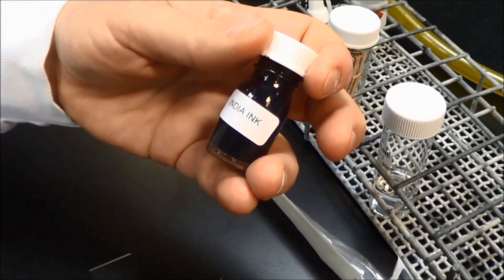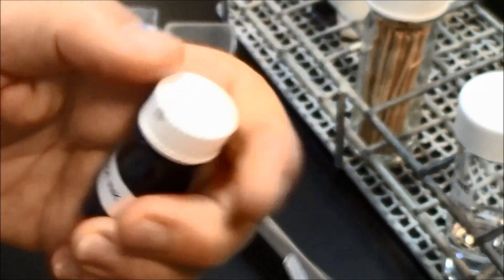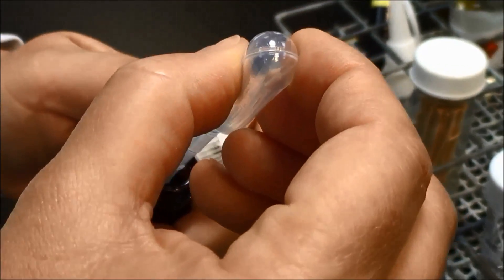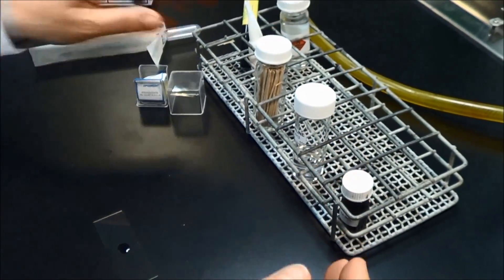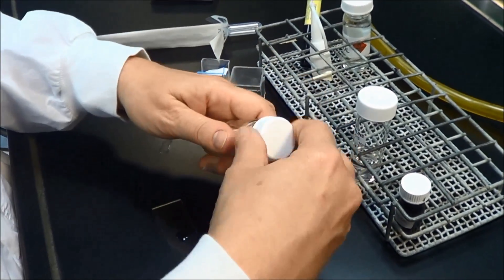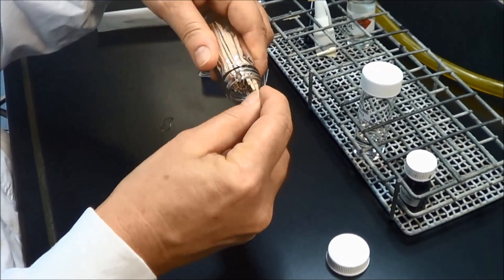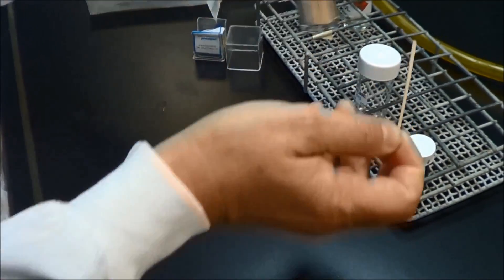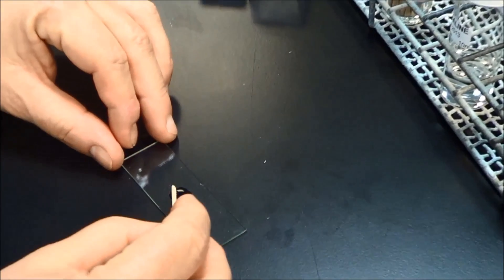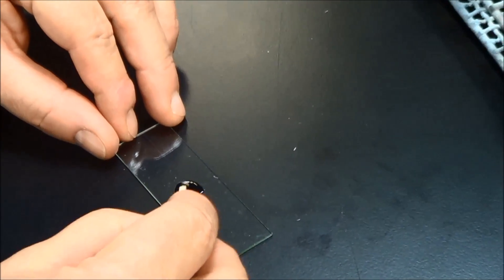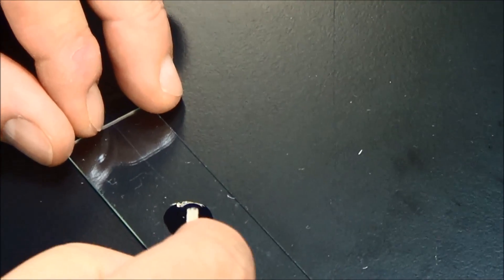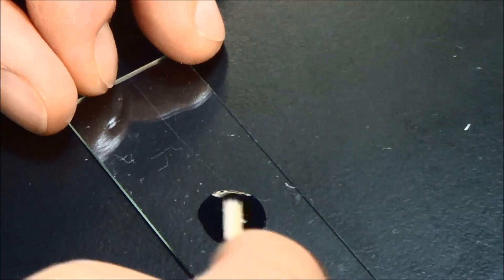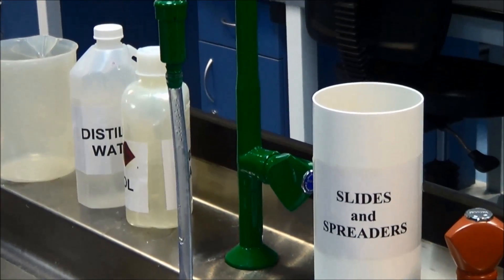Add an equal volume of India ink to the yeast suspension using a drop from a plastic transfer pipette. Mix with a toothpick until the suspension is homogeneous. Discard the toothpick into disinfectant.